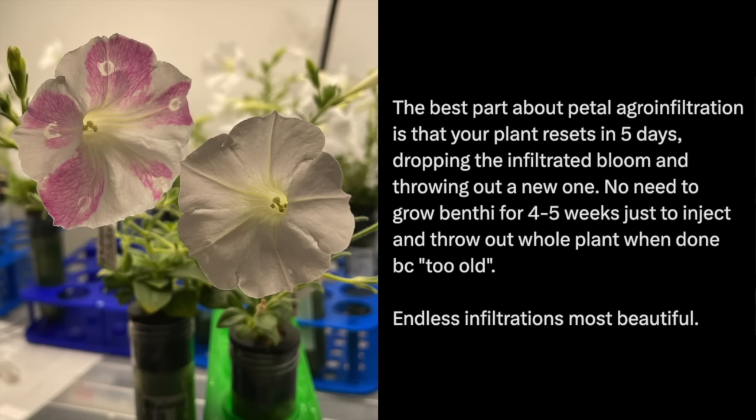It depends on the plant, right? So if the transient infiltration works with Agrobacterium, then the stable transformation with Agrobacterium will also work. And so what I do is I take a bit of the plant that I injected, not the actual injection tissue, but just of leaves. I surface sterilize the tissue, make some leaf discs, and then I co-culture the leaf discs with the Agrobacterium that I used, right? In the same type of modality.